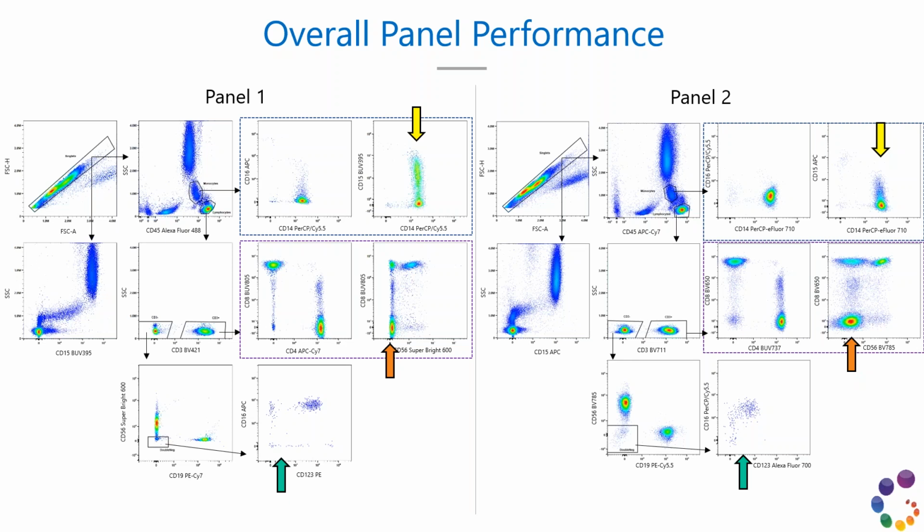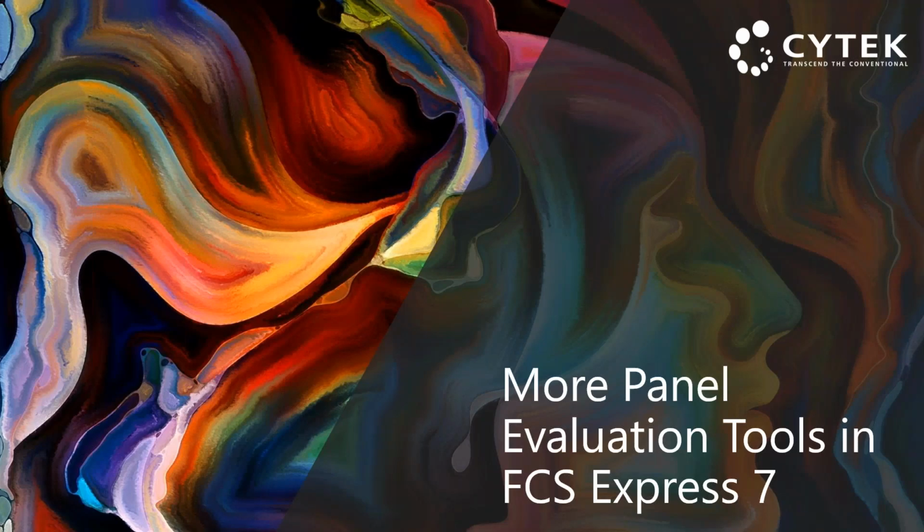To continue diving into our data, now we're going to take the FCS files into FCS Express 7, and Sean's going to show us all of the cool new tools over there.